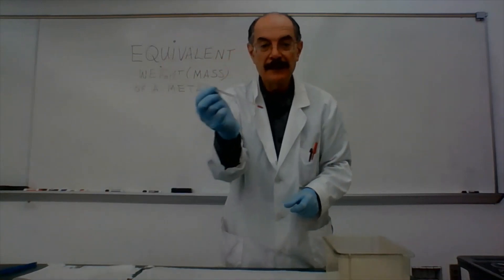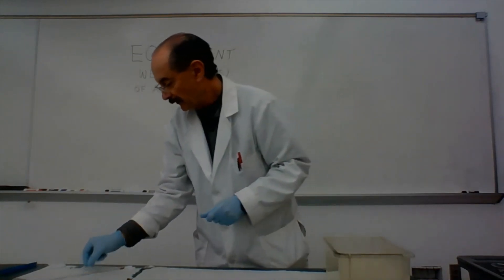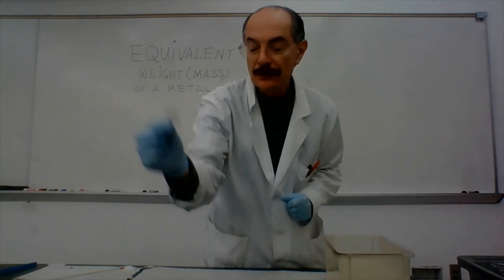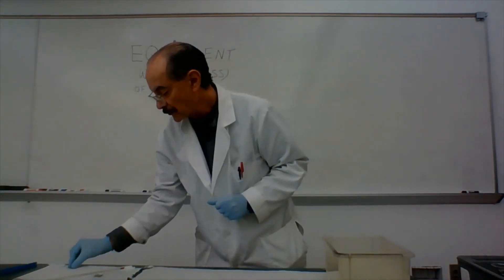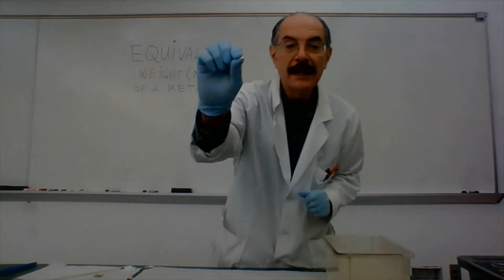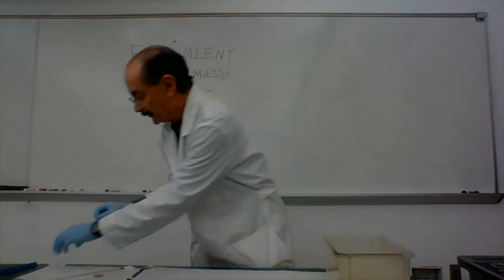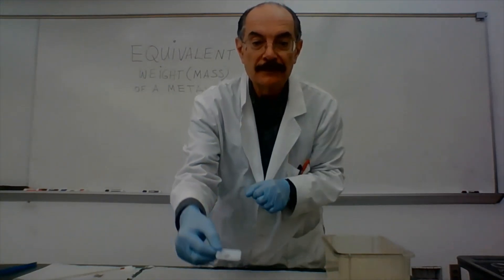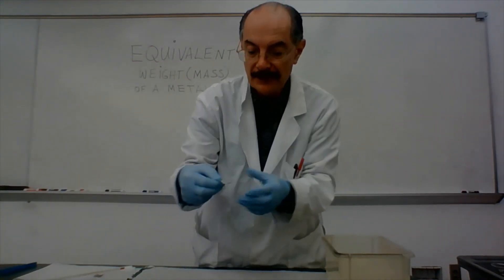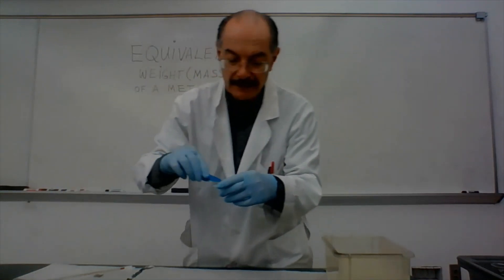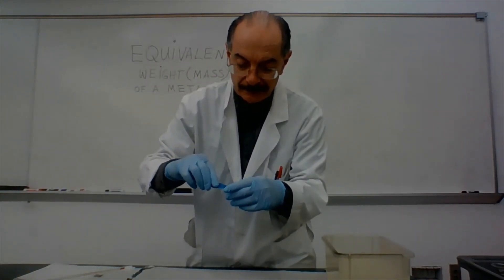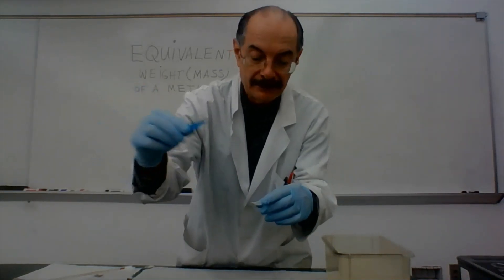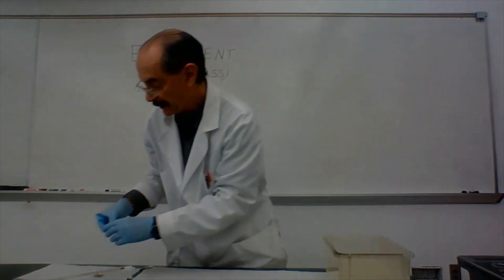You'll also receive a thermometer and you're going to be picking up a piece of metal mesh that you're going to use, and also a very tiny piece of metal which you will want to weigh. So I'm going to use one of these little plastic vials so you can weigh the metal. It will be kind of like a little piece of metal that you have in there and you're going to take the mass of that.